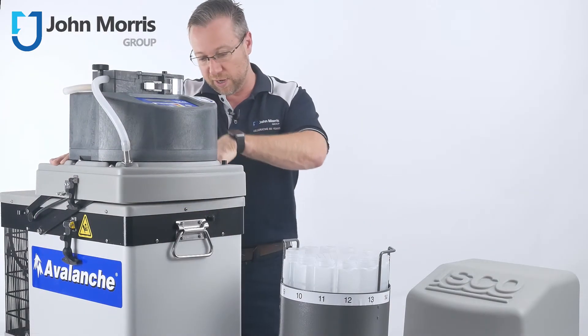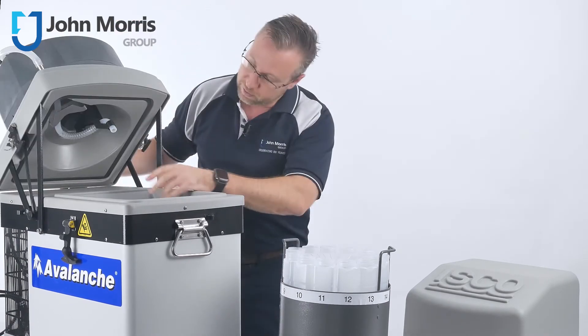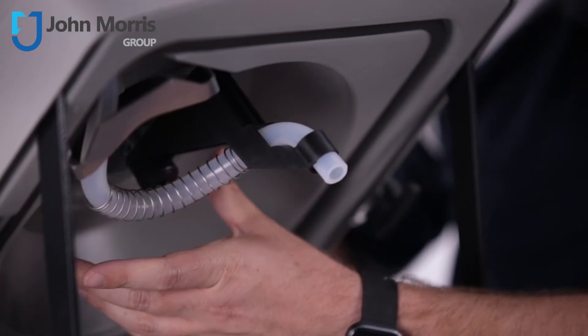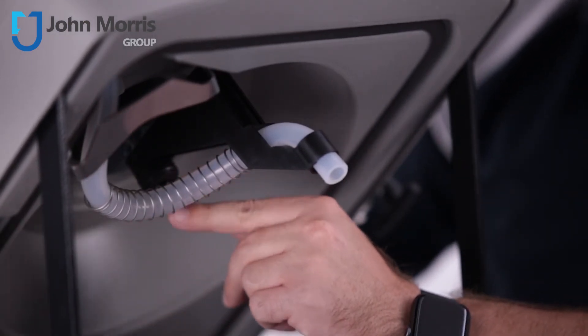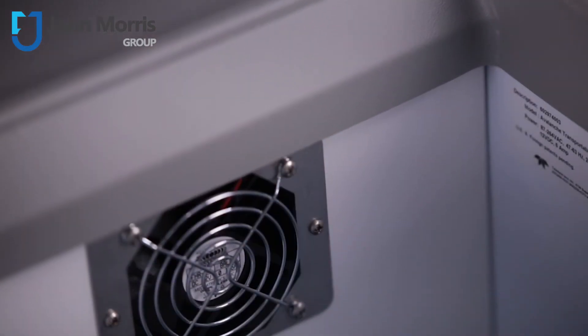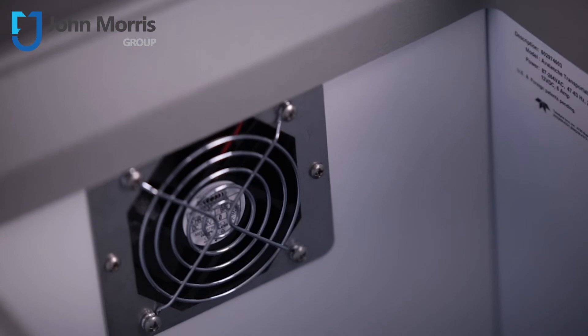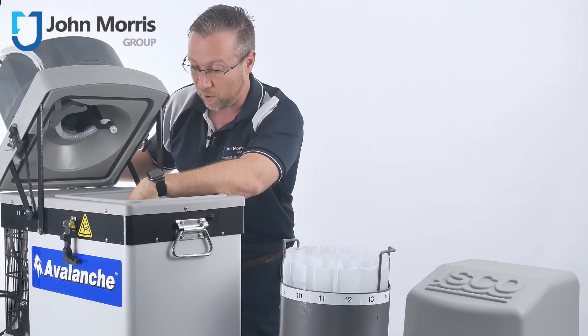To open the unit up, undo the clips — one here and one there. You can see here I've preassembled the distributor arm, but you could also have a single bottle configuration, and in that case it would sit directly in the middle. There's a fan inside to distribute the cool air, and there's also a temperature sensor inside to make sure the unit is running at the right temperature.